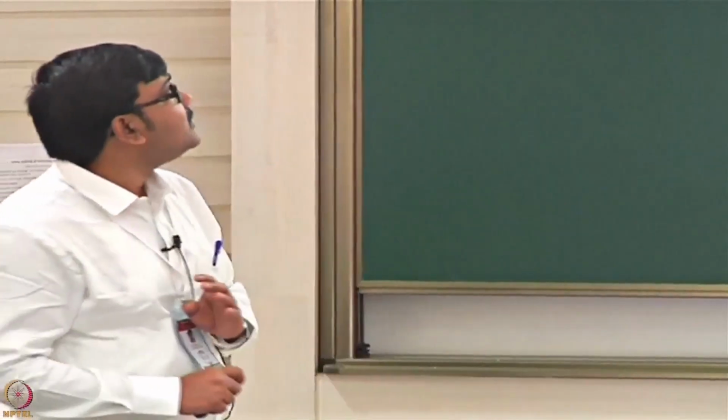Now we come to the mass spectrometry. I am covering the basics of mass spectrometry and am not going into great detail on all the parts. So what is mass spectrometry? Mass spectrometry is basically the production of ions that are subsequently filtered or separated by m/z.